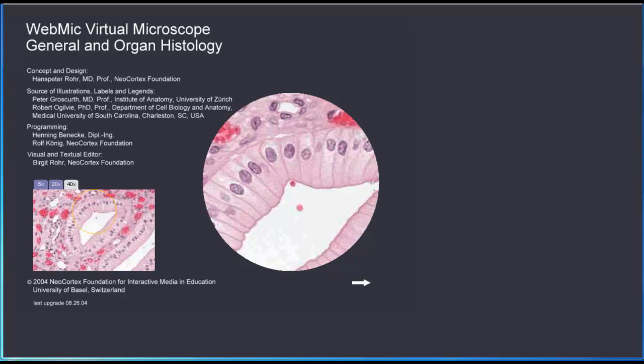This is a video tour of the new format for WebMic delivered over the internet, accessible through a browser. Usually it works in Safari, Chrome, and Firefox. Chrome is actually the best browser to use, and this is the WebMic in HTML5, so it should not be blocked by Adobe Flash. However, JavaScript does need to be enabled in your browser.